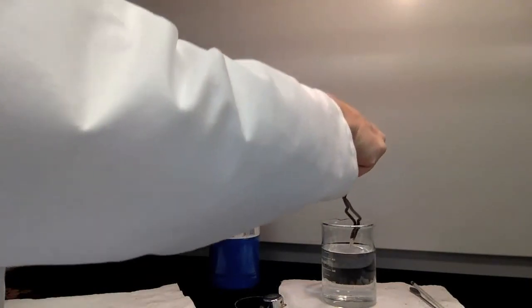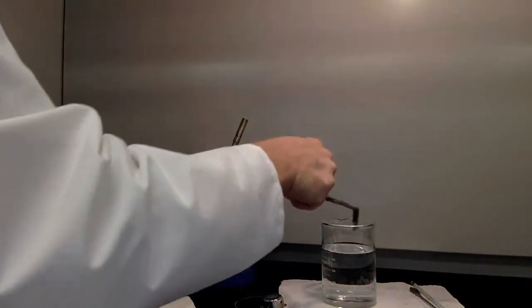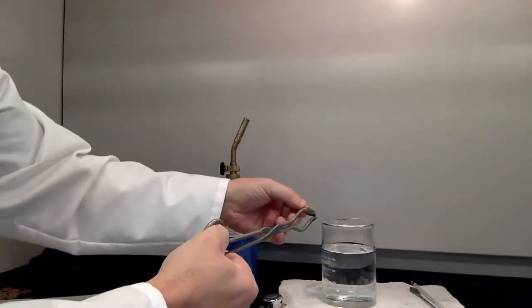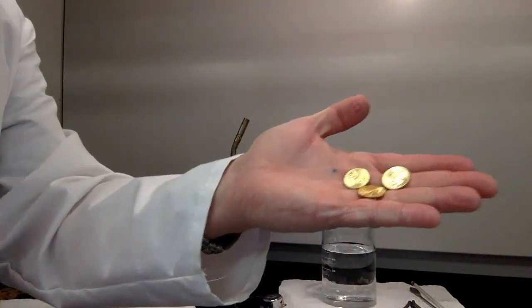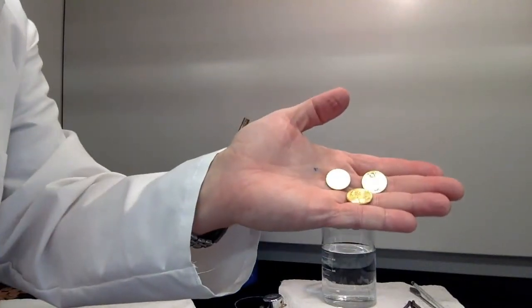Now that I'm done with my flame, I'll go ahead and turn it off completely. And there is my final penny. So I have 3 gold pennies here. And that's how you do it. That is how you make a gold penny.